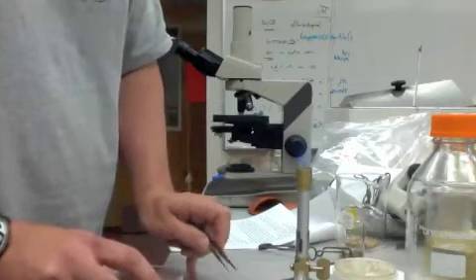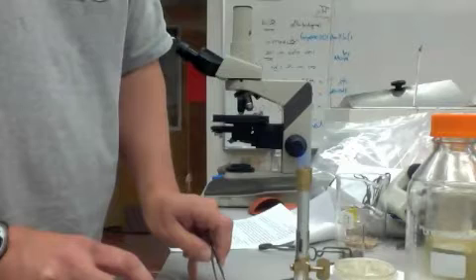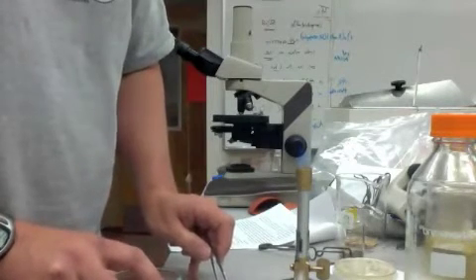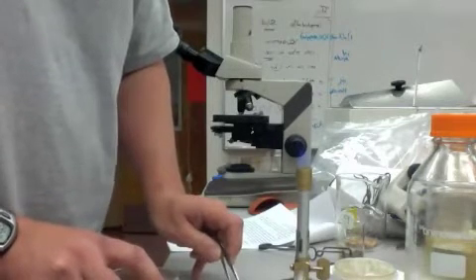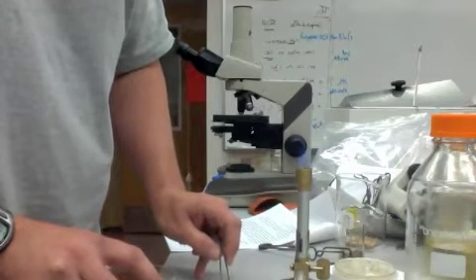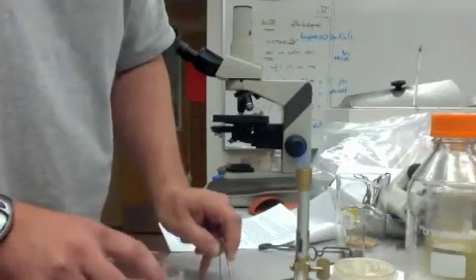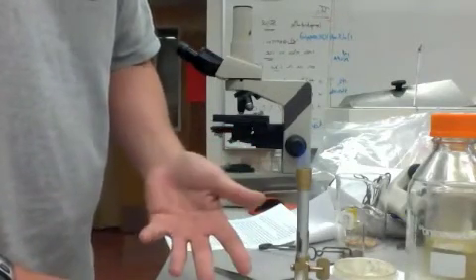And it will sit there, and the only thing you have to do is make sure that it doesn't sink completely and that when you put a bunch of them in, they don't all stick together. What you want to do is leave it in there, and when the plate solidifies, you'll have part of the dung pellet above the surface and part below. Once that's all solidified, you can then go ahead and sprinkle and pepper just like we talked about.